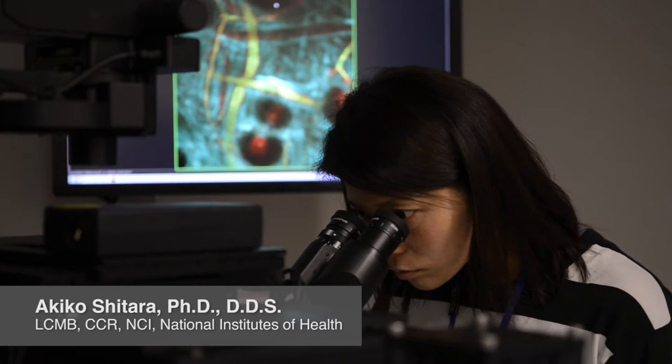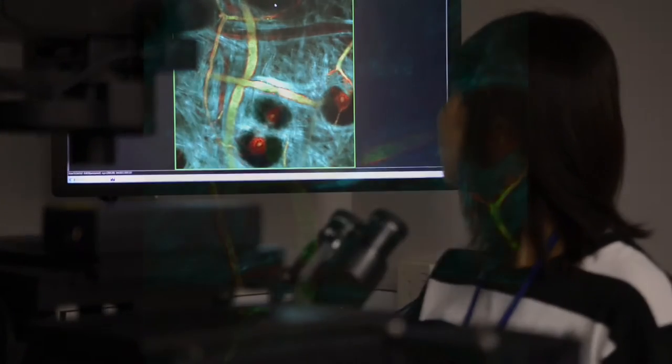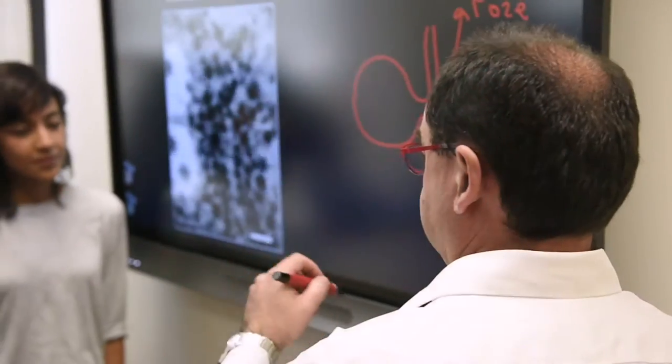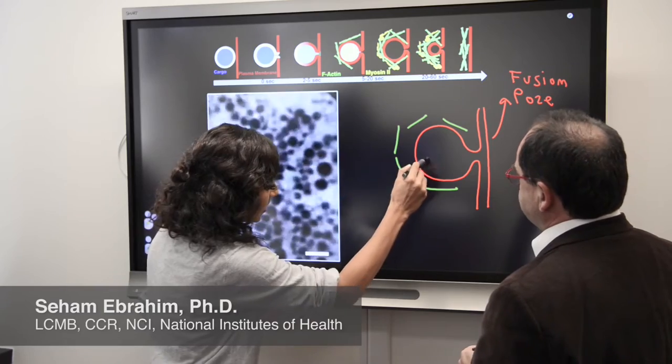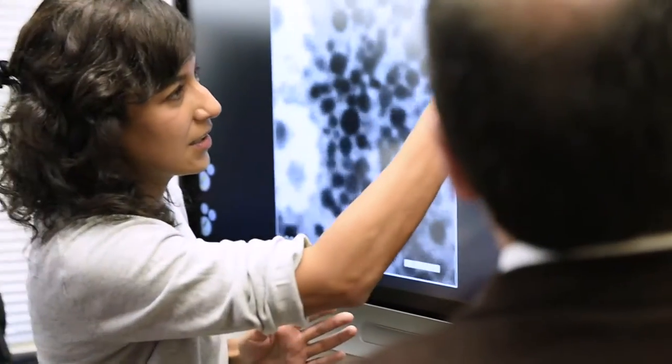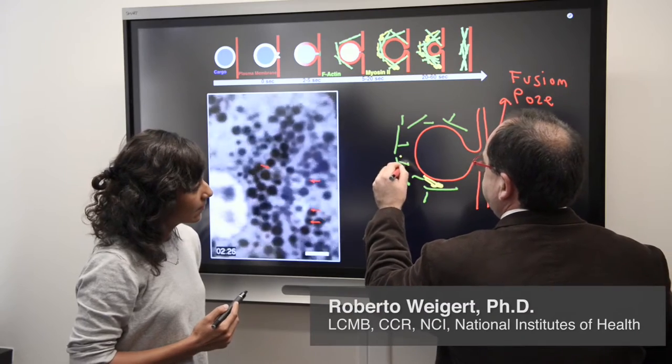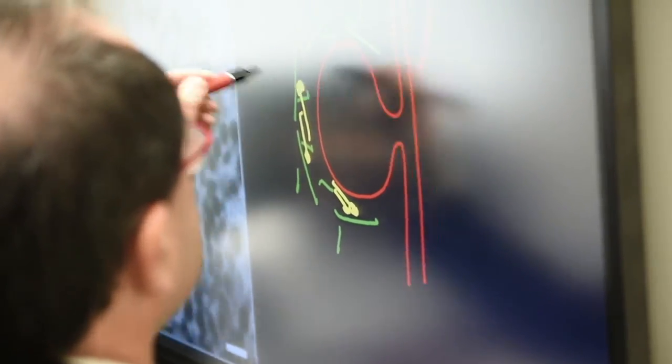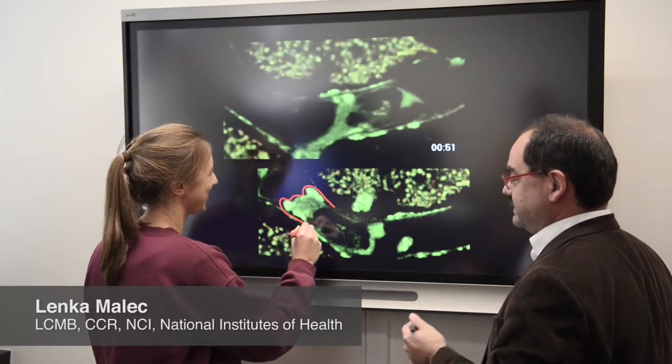Every day, we go to the microscope, and we have the opportunity to unravel new biology and ask new basic questions. Our main interest is to understand how cellular membranes change shape during biological processes. This is called membrane remodeling, and we want to understand how certain proteins provide mechanical forces to deform membranes. One of the processes that we study is protein secretion in exocrine organs.